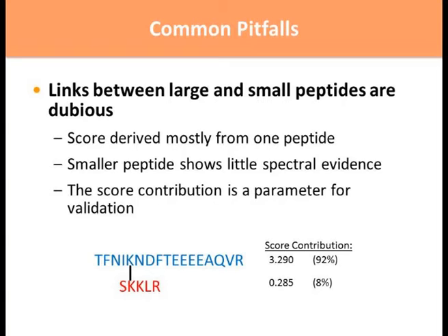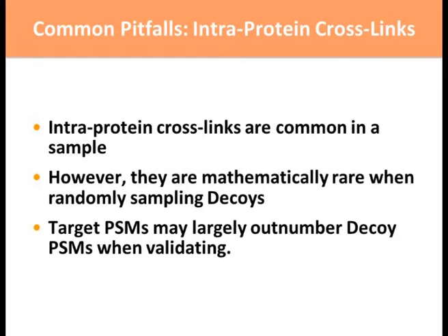The Percolator algorithm does its best to solve these. As one of the parameters, the score contribution of each peptide is included to help identify when these PSMs are correct or false.